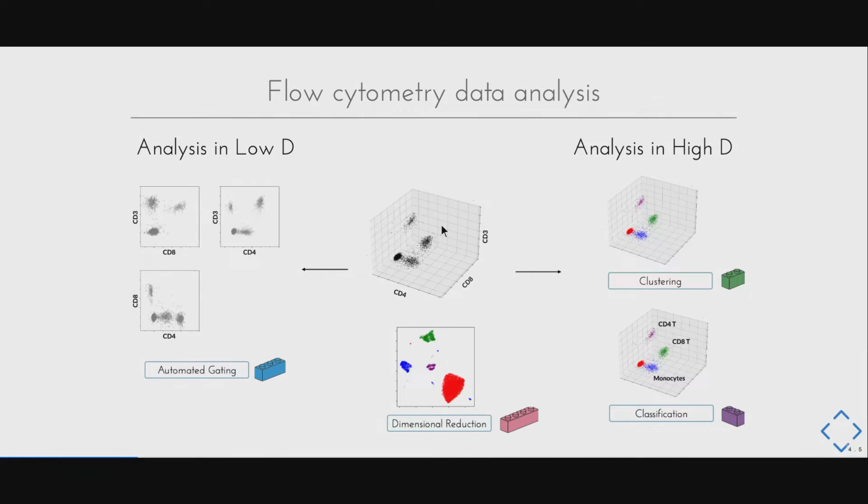For example, let's look at this. Suppose we have flow cytometry only measuring 3 markers, CD3, CD4, and CD8. So these 3 parameters form a 3D data space. Those black dots in the middle represent the cells distributed in the 3D space, and the gray dots on the side and bottom are projections of these cells onto the different standard 2D planes or surfaces.